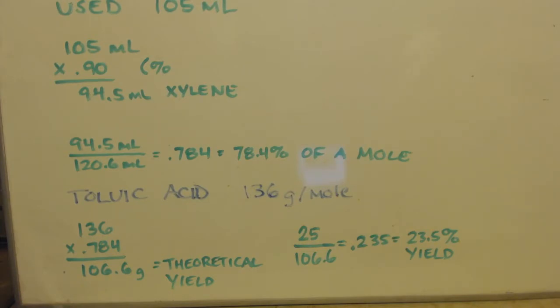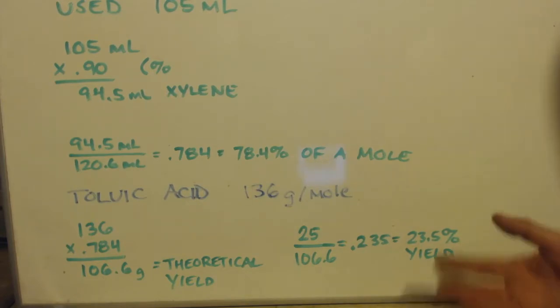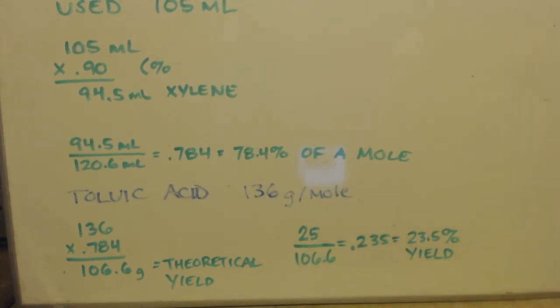Also, 3 times I spilled liquid, and that, of course, made my yield go down. As a matter of fact, the toluic acid at the end was 25 grams. I've already spilled some. I didn't reweigh it, but I'm down to 10 or 15 grams now. I barely have anything from this whole experiment. I've never spilled so much crap in my life. I'm actually leaving a lot of information out, but I'm on video 4 here, come on. But I love questions. If you have any questions about mechanisms or anything about what I was doing, ask.